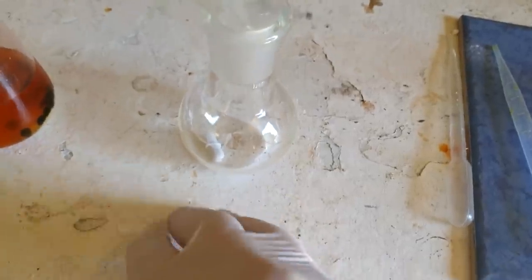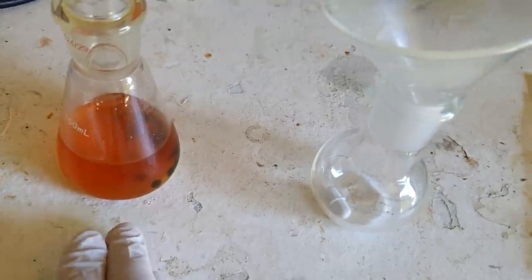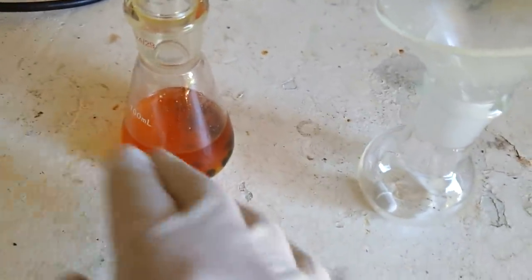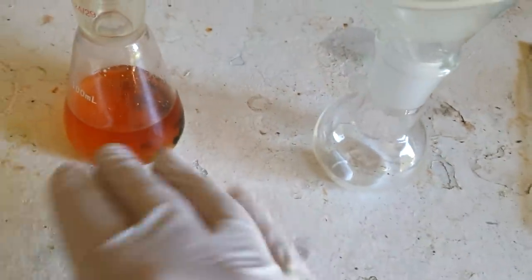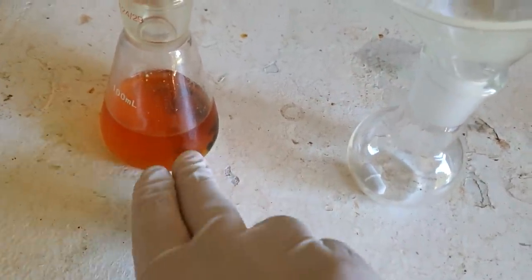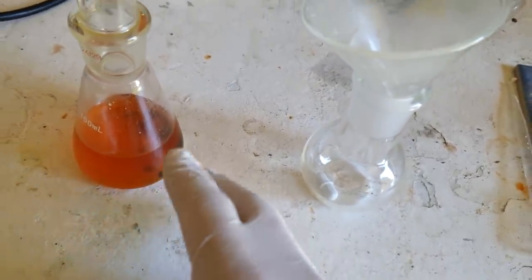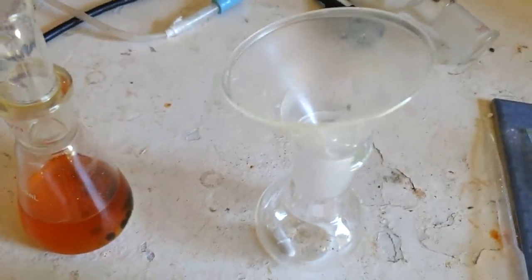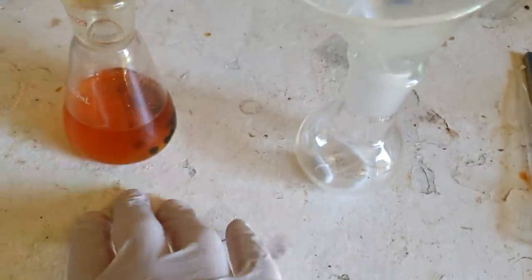So I'm just going to blow some air through it, give it some very gentle heat, because we want to remove pretty much all the dichloromethane. We want to remove dioxane as well, but we don't want to heat it up to 100 degrees or anything like that. But I think there's only a little bit of dioxane left, so if we just blow some air through it and give it some gentle heat, the dioxane should evaporate off. And we'll be left with potentially an oil of our brominated species, which we want to then crystallize out, which we will do by performing some black voodoo magic and praying to some gods, and hopefully it does crystallize out.